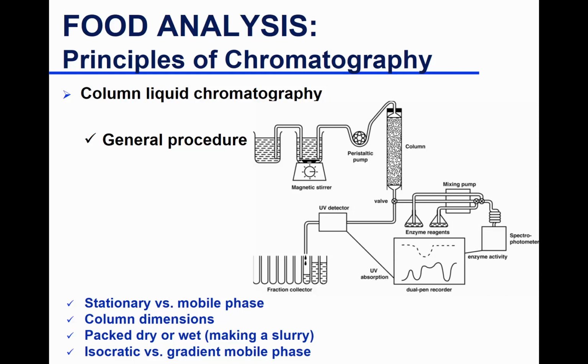So in a system with low pressure liquid chromatography, you have the column, and you fill the column with your stationary phase. I want to say stationary phase filling of a column is kind of an art. Have you done that, Alex? Do you want to speak to that a little bit? Tell us how you fill your column.